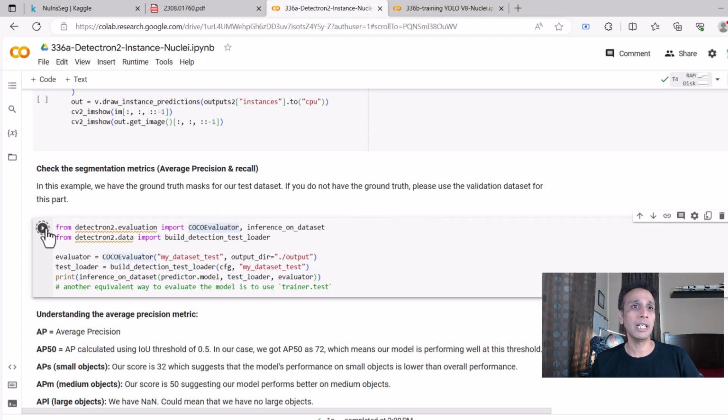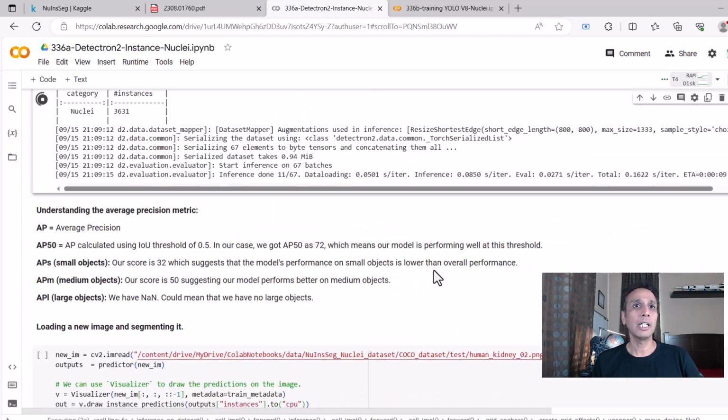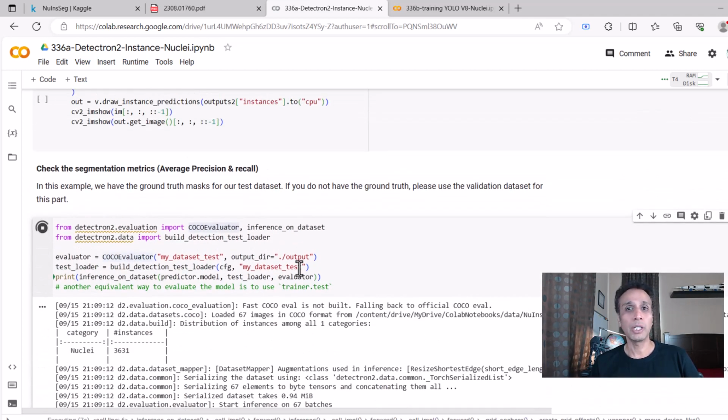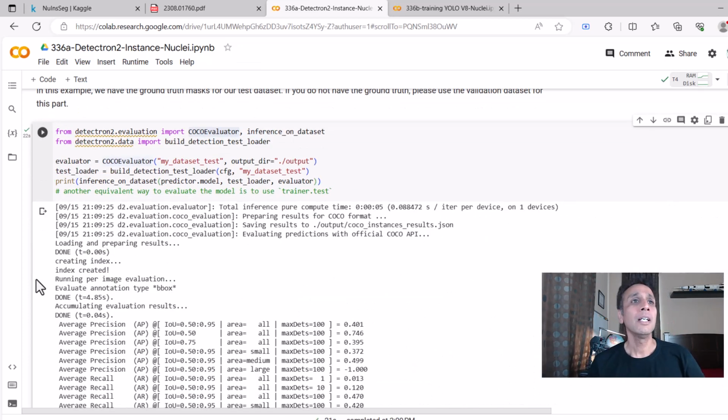So let's do this. I forgot what I got earlier. I think I added notes down here. I did not open this notebook in 2 weeks, so let's be surprised. I did something 2 weeks ago. Everything was working. I'm like, great, ready for my tutorial. And here you go. I'm sitting and I'm like, okay, so why did I write this?